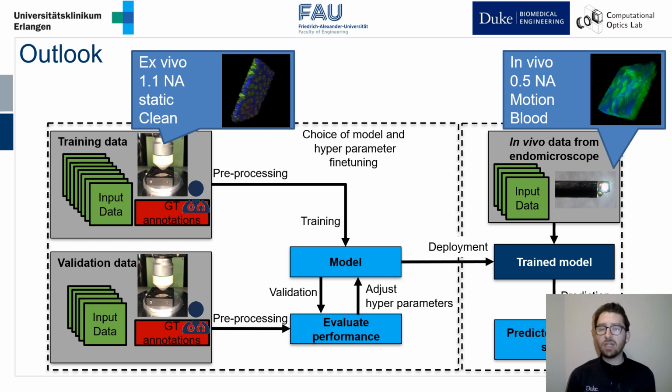If we had this pre-trained model and if it would work successfully in the in vivo case, I think this would be a really powerful in vivo AI-driven inflammation detection tool. But there's still some work to be done, and this is just a concept for the future.